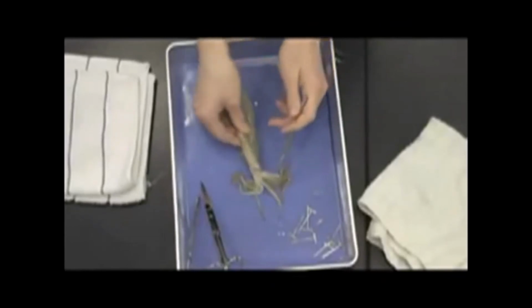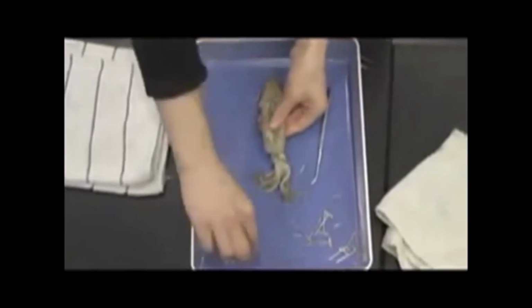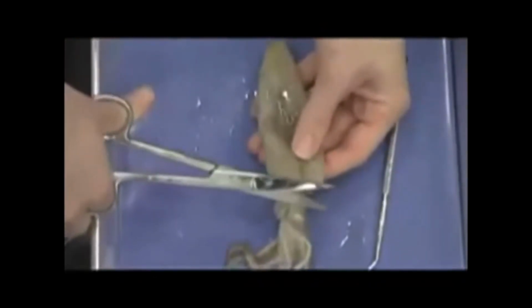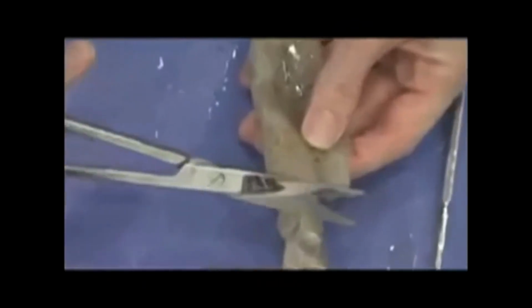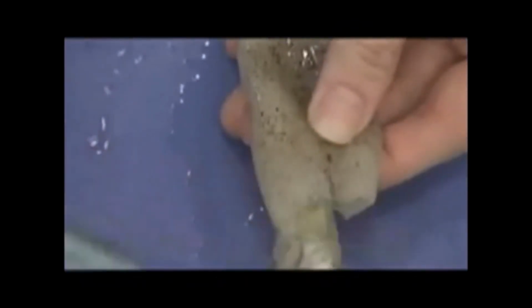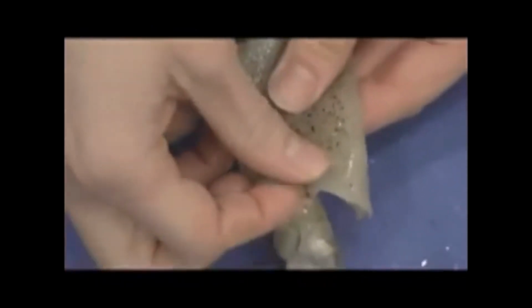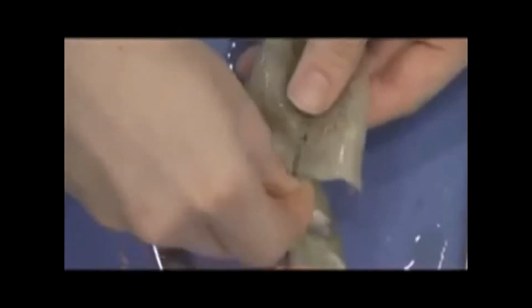And for your final step, try to remove the pen. First, like I said, you'll have to turn the squid over to its dorsal side again and use the scissors to cut the very end. And what you'll be doing is trying to very gently pull the entire pen out in one piece. So if you can grab it by the end, it'll probably look clear. Just gently tug on the end to be able to get the pen to come out.